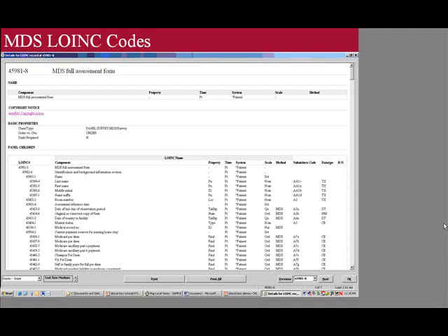You just said something that struck me. You said for a survey, you had the exact answers. If the survey specifies that the answers have to come from a particular list, then we can capture that in LOINC. Wouldn't you have that as part of a panel? That's what I'm wondering. Yes. You can do it with panels also.